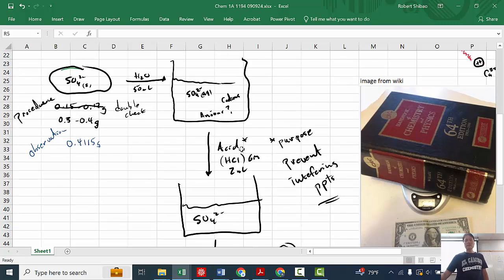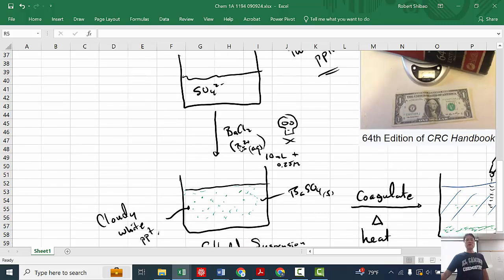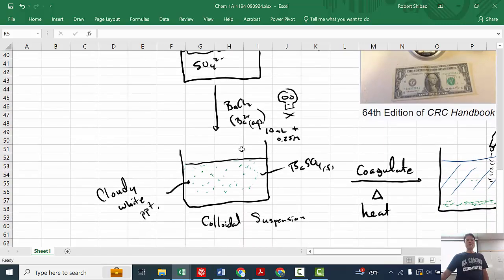Like I said, barium chloride is toxic, so avoid contact with that. Barium can screw with your magnesium and calcium. Barium sulfate's not so toxic. I had to drink this stuff. I didn't die. And barium sulfate's generally regarded as safe. But don't touch it, and try not to handle it too much.